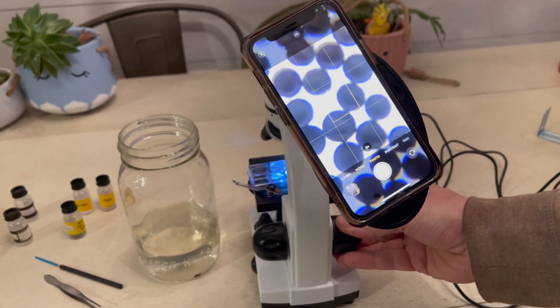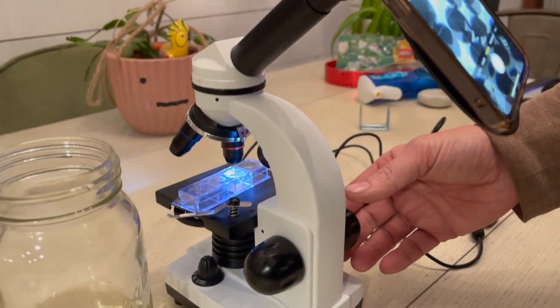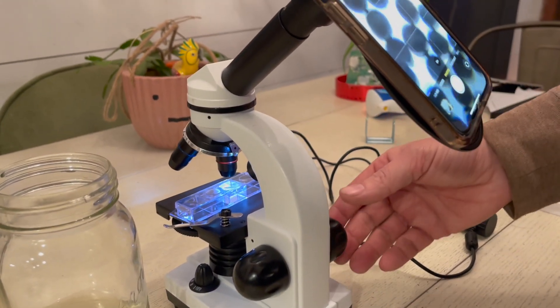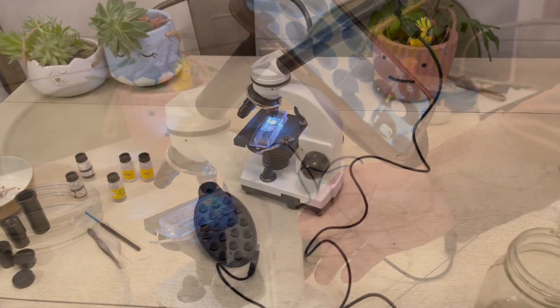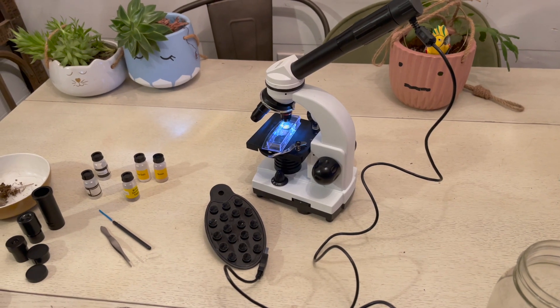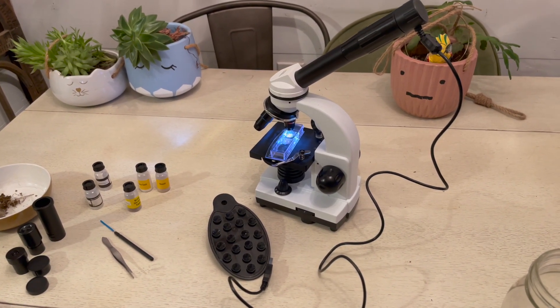All it takes are three AA batteries to begin using the National Geographic microscope. The only thing I would recommend is maybe weighing it down a little bit, especially if you're using the smartphone adapter, because it can shake if someone jars the table or whatever surface you're working on.